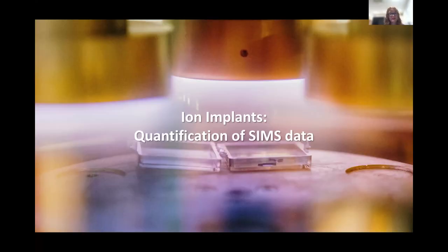So, ion implants for quantification. We use ion implants with most of our analysis. To be able to quantify data is brilliant. SIMS is a comparative technique. If samples are run on exactly the same day under the same conditions, they can be compared if they are of the same matrix.